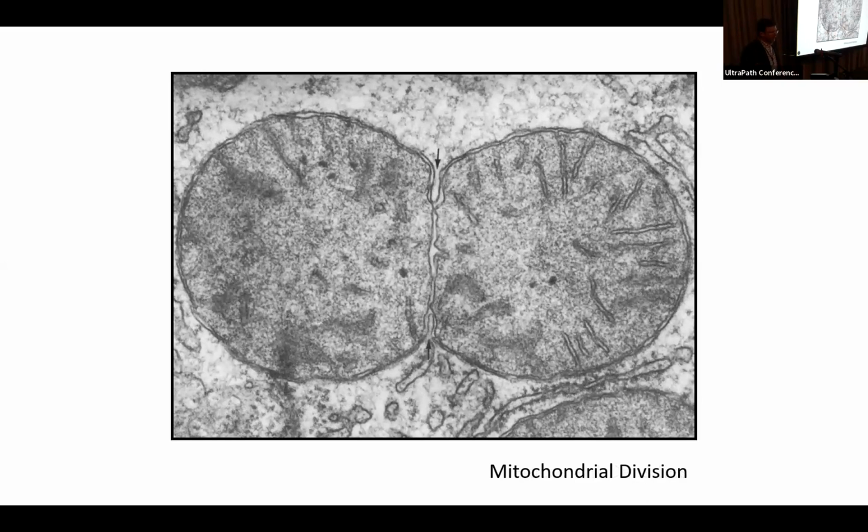In addition to the cells being three-dimensional, another point to make is that cells are also very dynamic, quickly changing and constantly moving. Organelles within the cytoplasm are moving around right up until the time that we fix them and kill them with our fixatives, putting all of the organelles into kind of a permanent state of suspended animation. So bear in mind that what we see with our static images really only represents what that cell looked like at that critical moment when they were fixed.